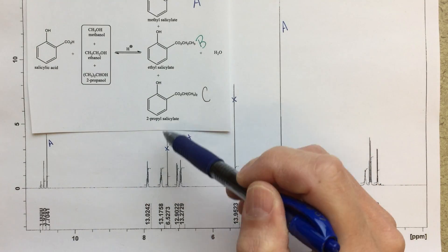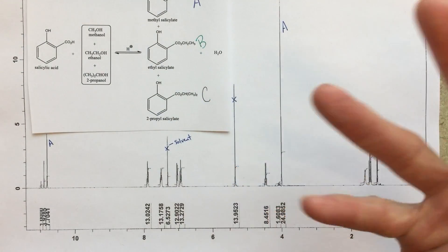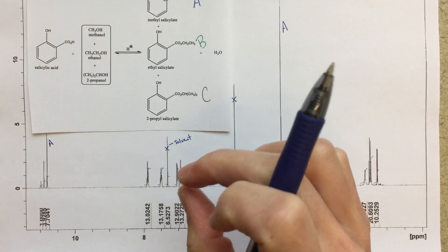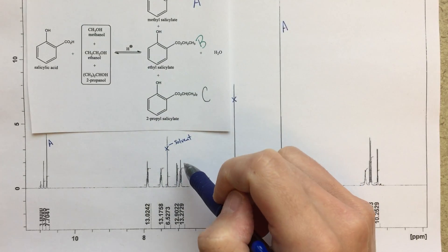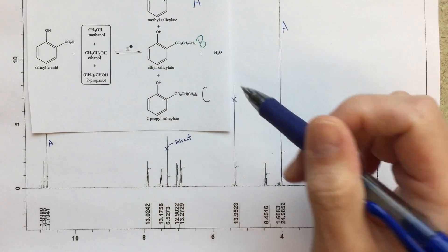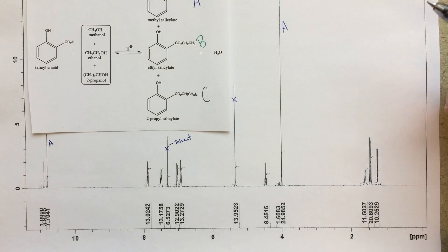And we could worry about trying to identify those, but I think it's just not really worth our time. All four of these peaks, they're going to be the aromatic region peaks, and they're all going to be mixed together. So if someone wants me to go into more detail with that, we can try to pick those out a little bit better. But I think that it's safe to say, this is the aromatic region. It's a mixture of all of those, and we don't really need to spend too much time worrying about that.